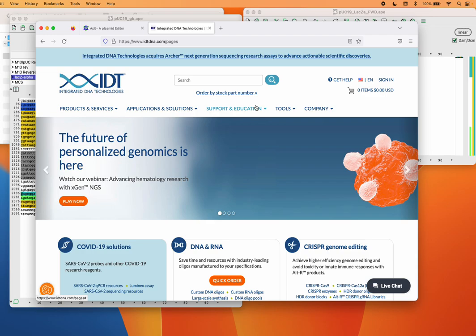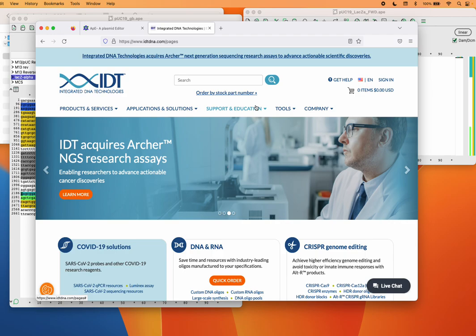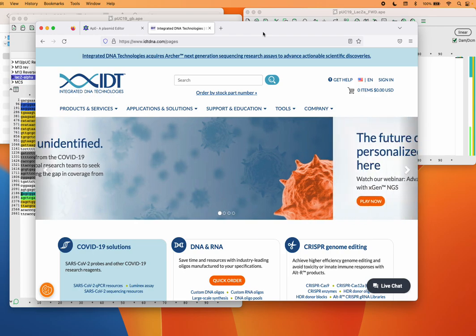Great. And then you get those primers. You need to add some ultra water to those, right? So they come as dried samples. You add some ultra water to those to get the right concentration. And then you can add them in your PCR reaction along with your DNA template, and you're good to go. And that's, again, the activity you did in the Amino Labs PCR-it Kit.